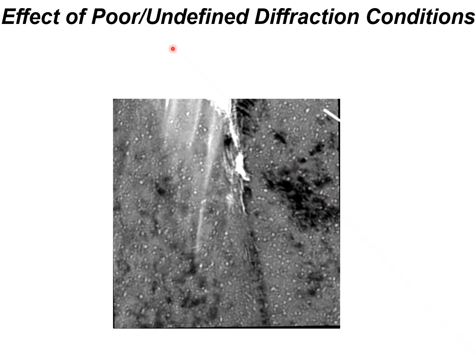So another example of misinterpretation of images is this one. This is also from the Inconel. So in 2018, I was at a meeting and some researcher got up, presented this image. It's an EBSD or a thin foil, a foil produced by focused ion beam of a microtensile tested sample. And what they observed is a crack moving in this direction. So we get a crack forming along an interface with something here.